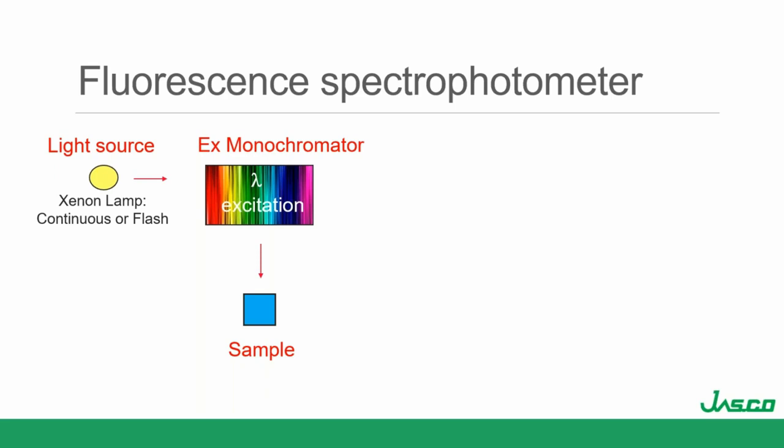Now, if I were just doing a simple UV-Vis experiment, just for comparison, if I'm sending light into the sample this way, I'd want my detector on the other side, right? Light in, light out. So I can say incident light, transmitted light, take a ratio, and boom, I've got absorbance. Now, is that a good place to put the detector for fluorescence? No, it's not, right?